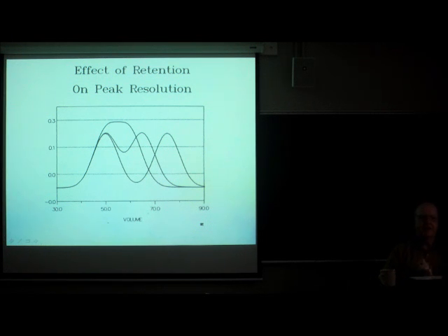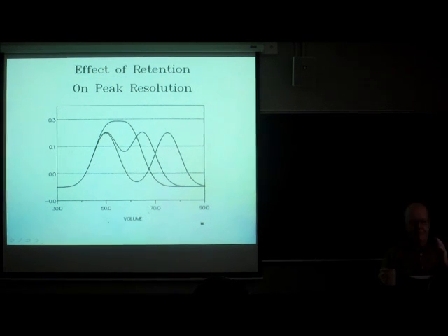Now the fun and games start. That's really everything you could possibly want to know about one Gaussian peak. But what we really need to know about is pairs of Gaussian peaks. What I'm doing here in this slide is I've got two peaks. The two peaks are identical.